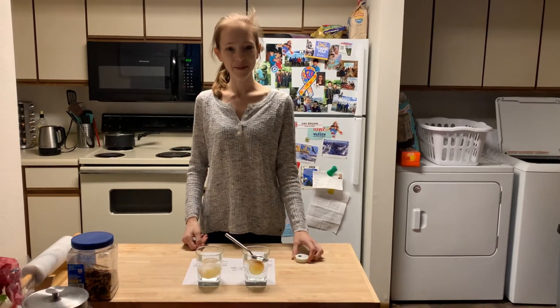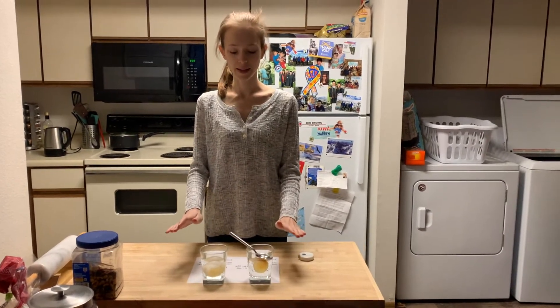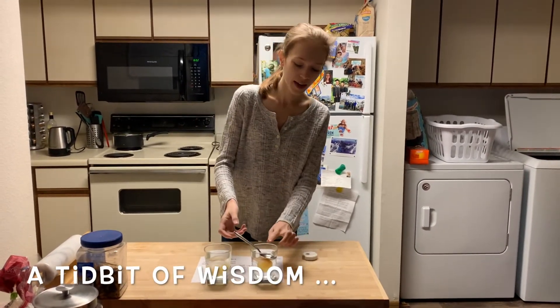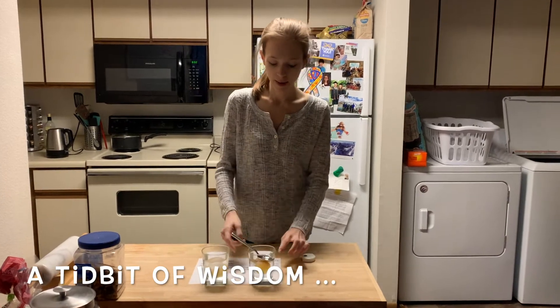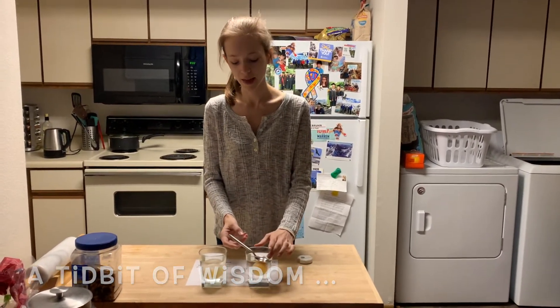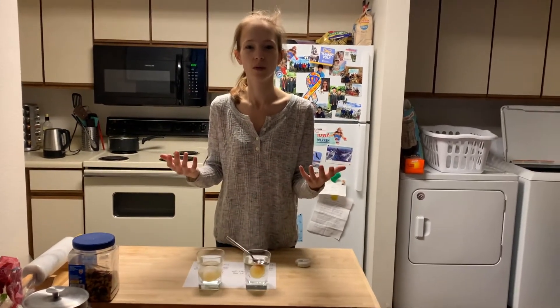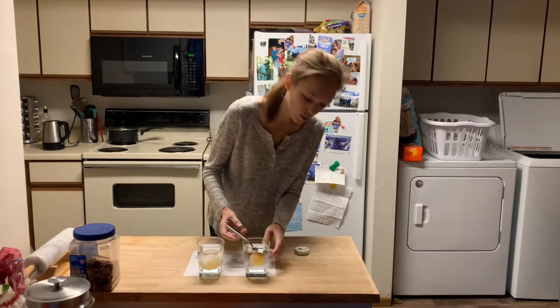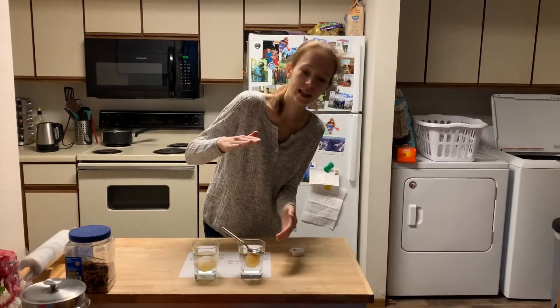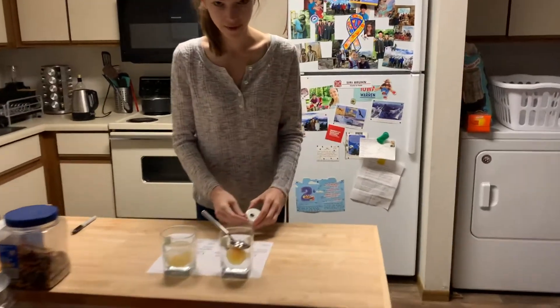It's day three and we've finished our experiment — we just need to get our last piece of data. In my corn syrup solution I put a spoon over the top of the egg because it was floating on top of the more dense corn syrup solution, and I wanted to make sure I didn't press it against the bottom. Let's get our last bit of data.